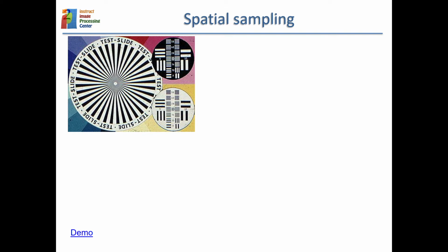And the reason for that is that some part of the optical device, either the acquisition, or even your eye, or the projector, is no longer capable of following these ups and downs so quickly in space. This smoothing of going up and down, I cannot follow you, will cause it to stay somewhere in the middle, and that is why we see it gray.